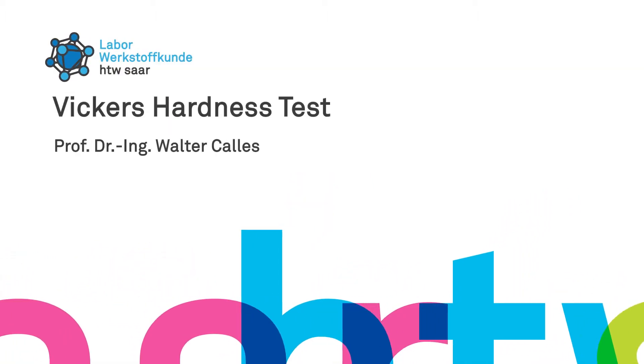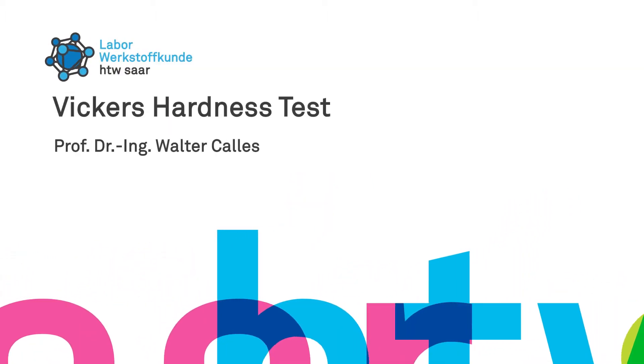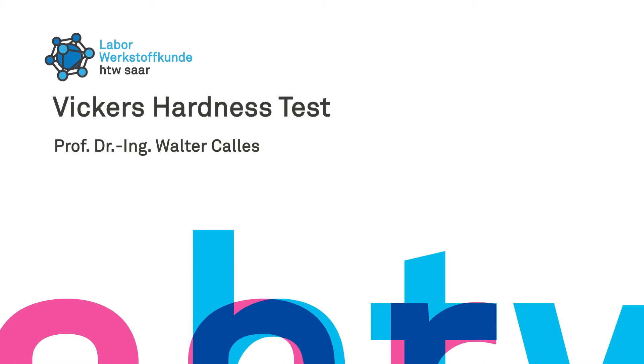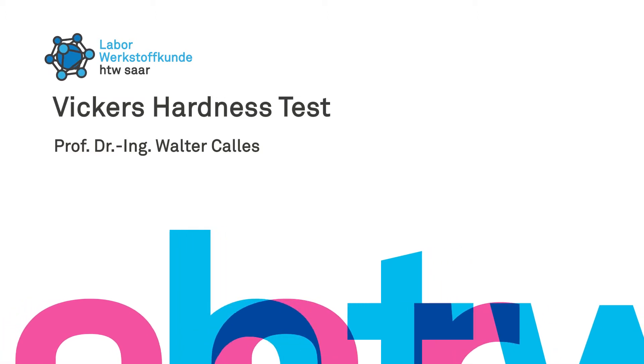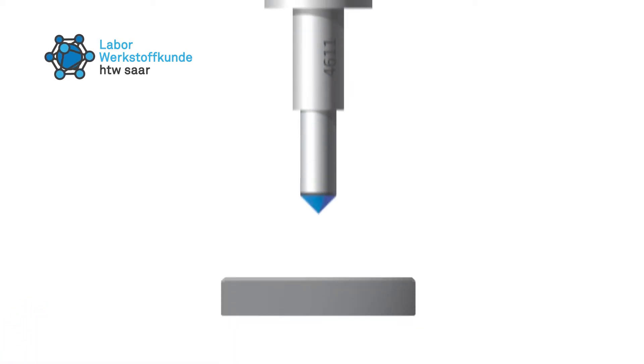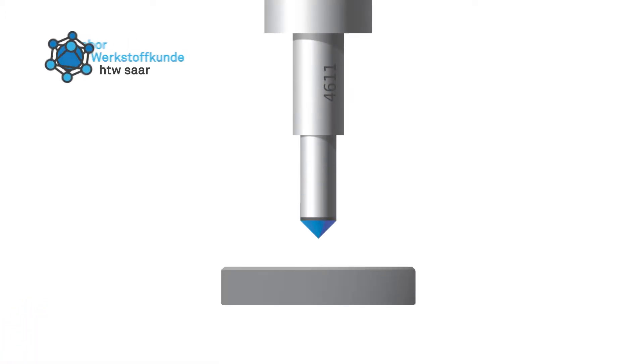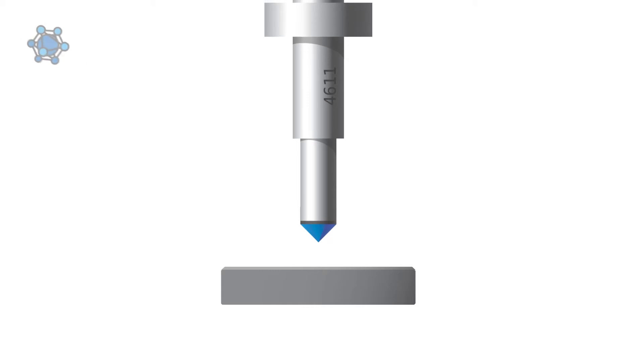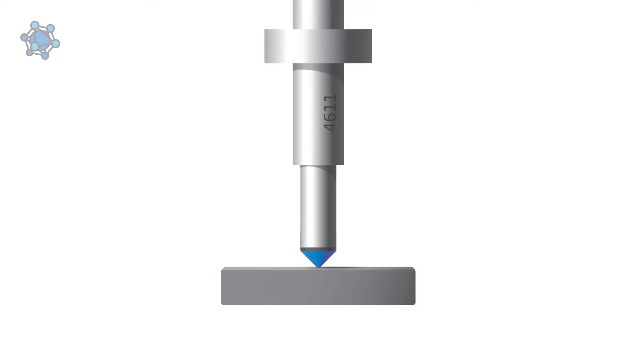Today we're going to subject the specimen made of C45 to the Vickers hardness test. In the hardness test according to Vickers, a four-sided diamond pyramid is pressed onto the sample surface with a defined force for a defined time.